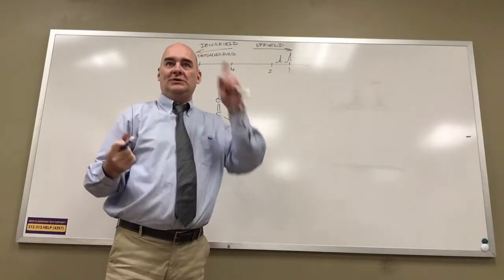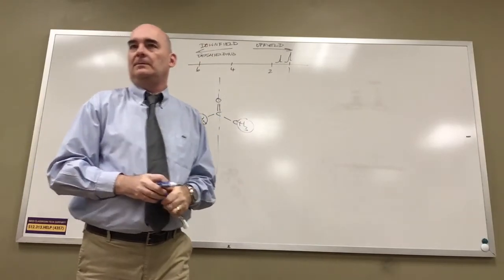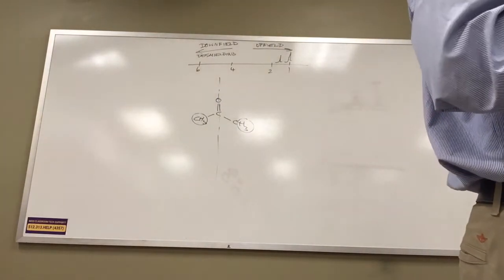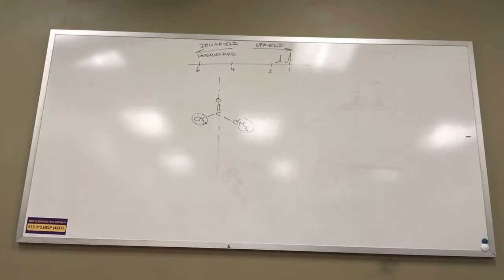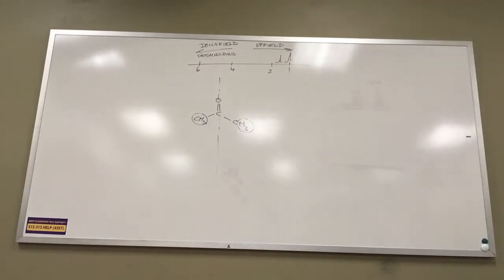So you get one signal. There's one environment for hydrogen in this molecule. Integration of 6.